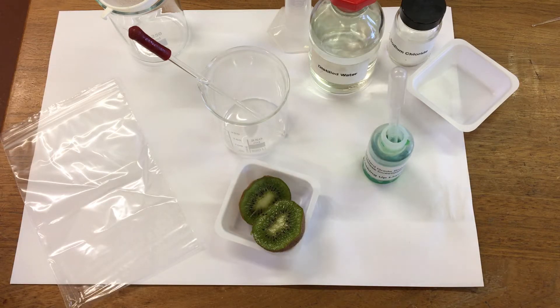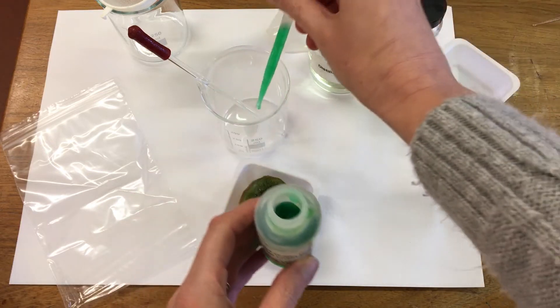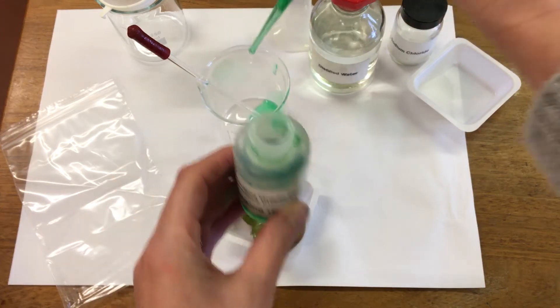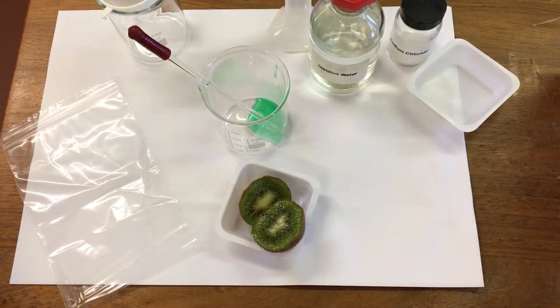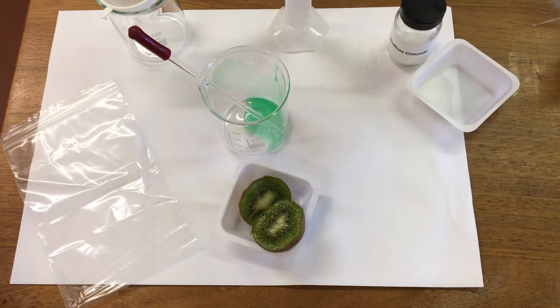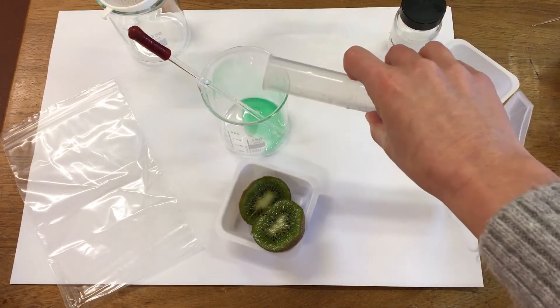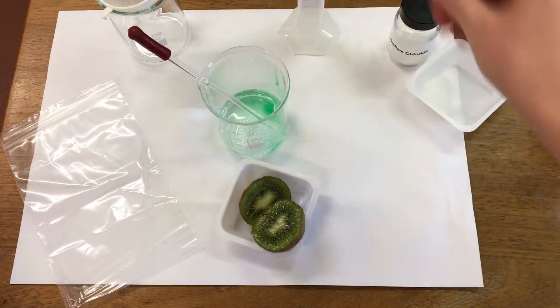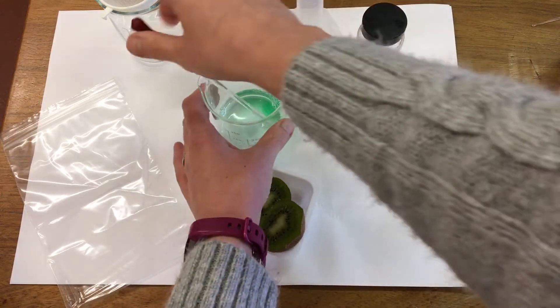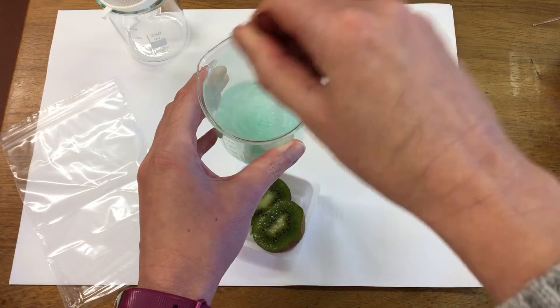First of all I'm going to use some washing up liquid — I'm going to put 5 ml into our beaker. Then we're going to use 50 ml of water and I'm also going to add 5 grams of salt. So the salt, the water and the washing up liquid is going to make our extraction solution.